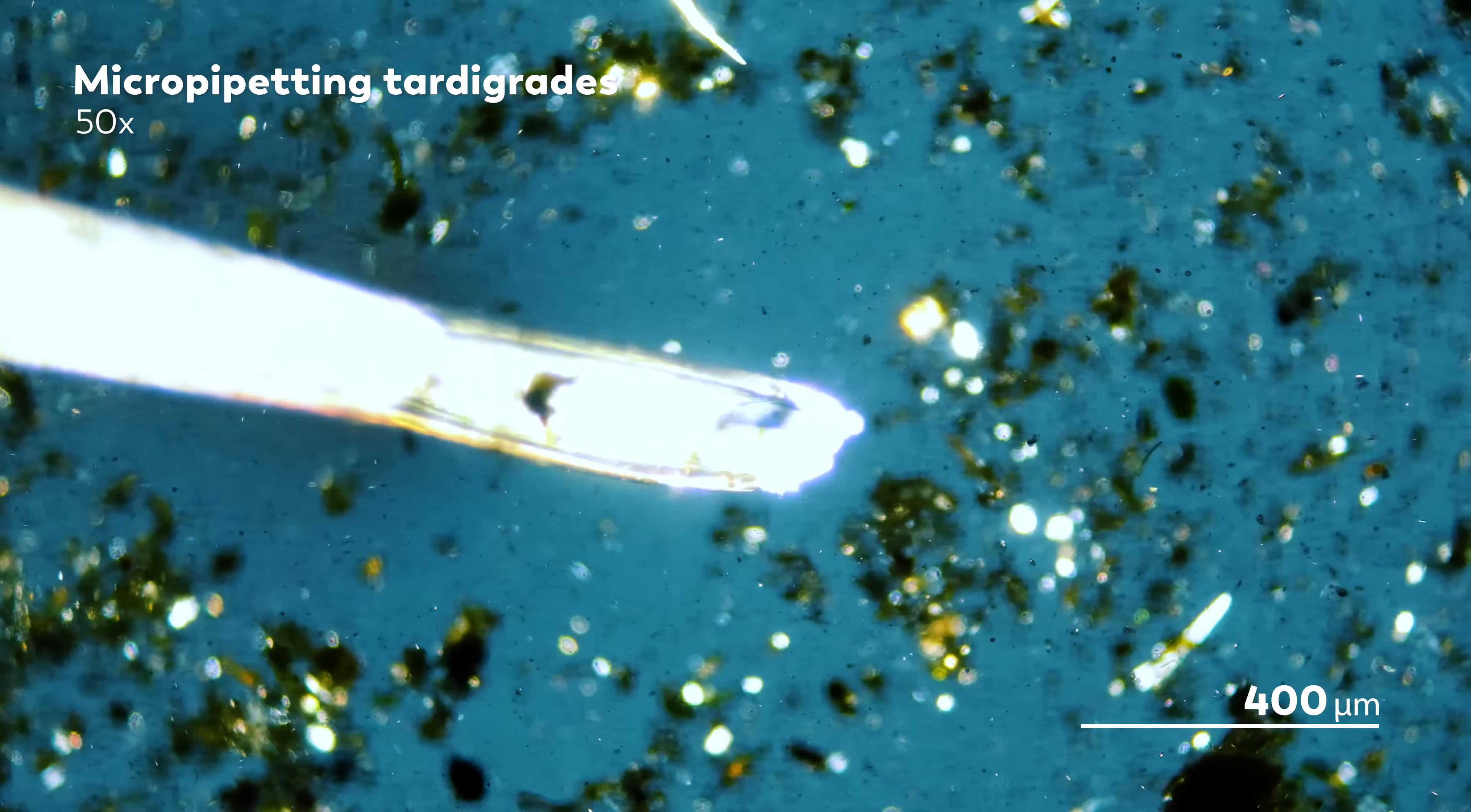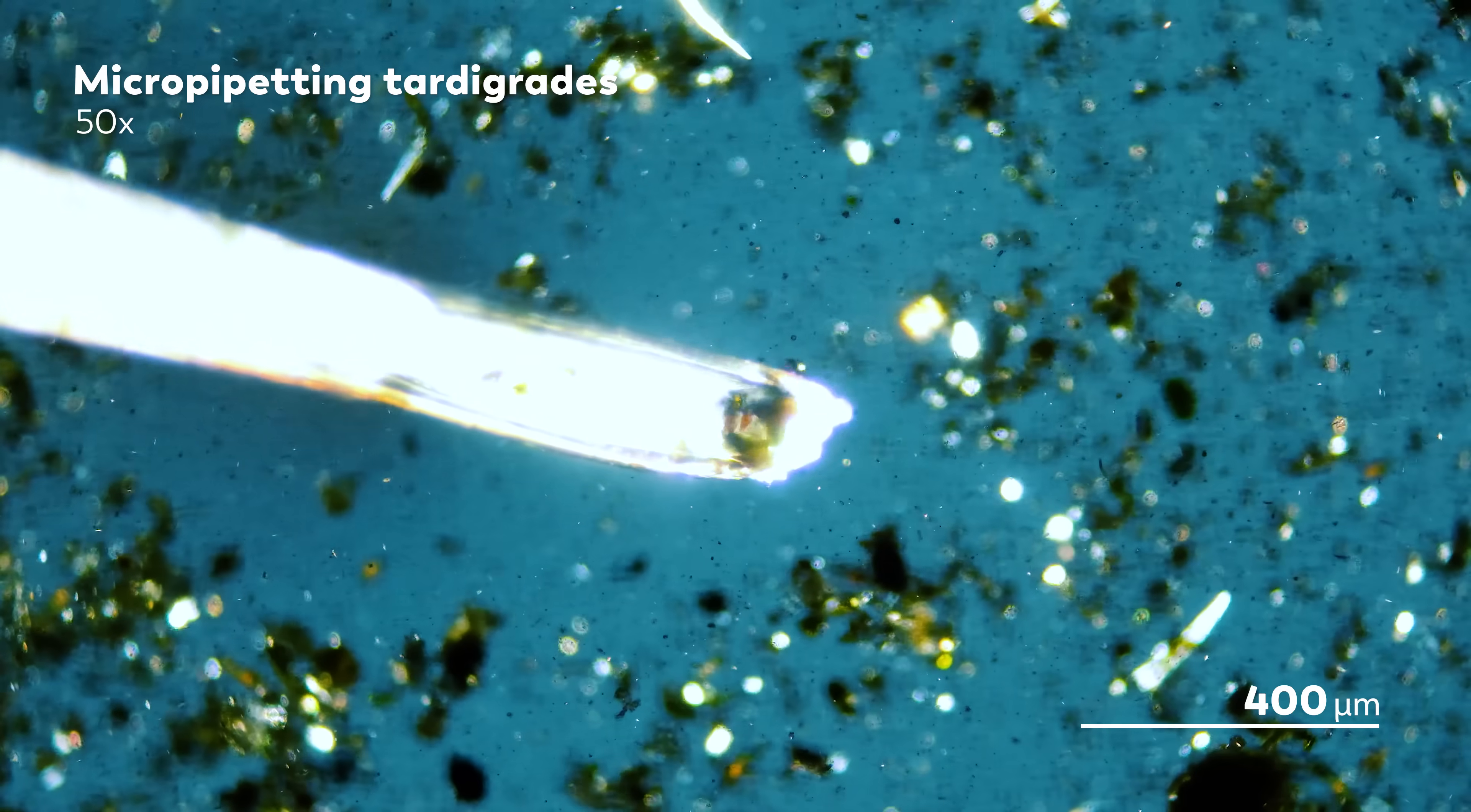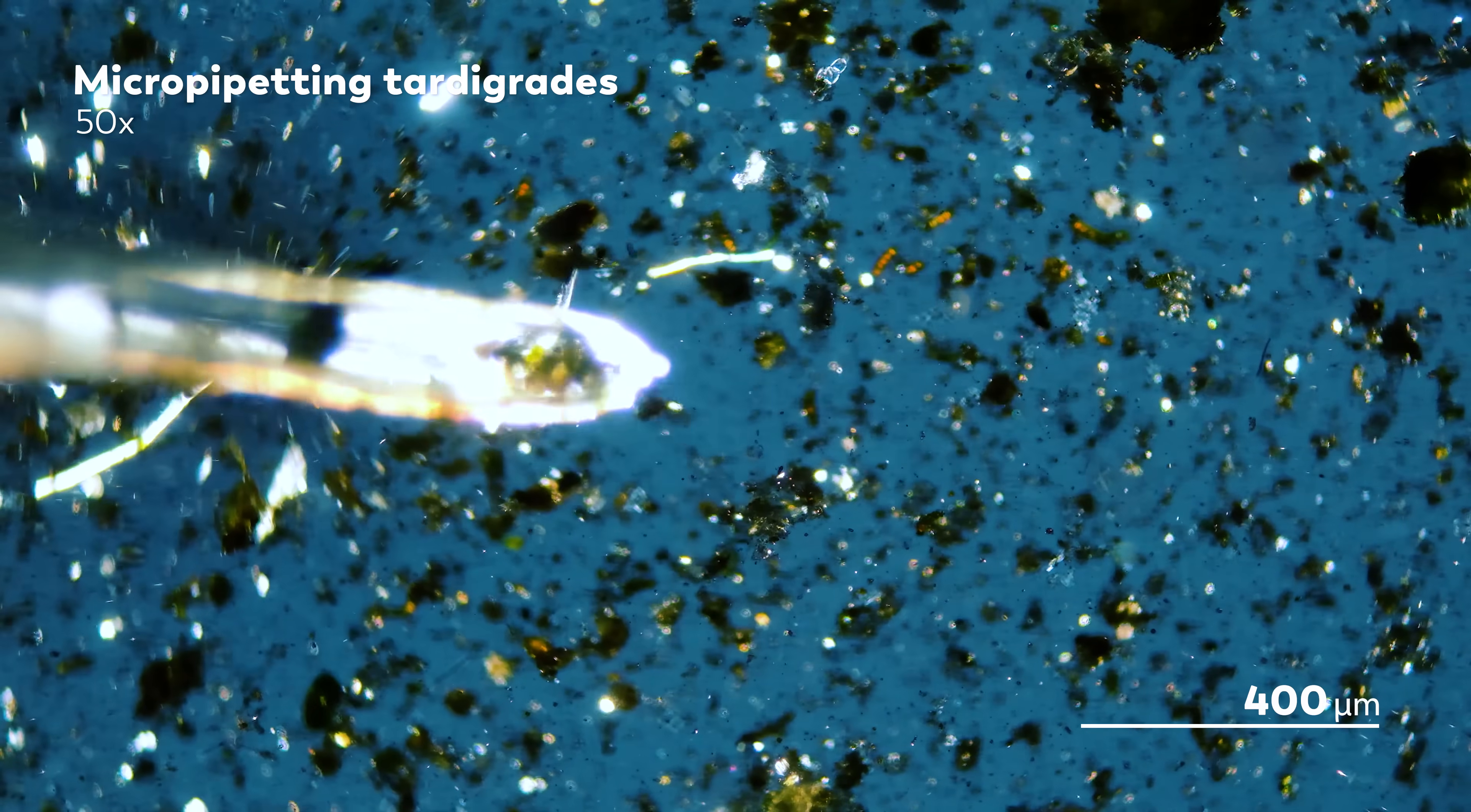To do micropipetting, you need a very thin tube. And traditionally, scientists use glass pipette tubes as the starting material for their micropipette. They heat the pipette over a Bunsen burner and slowly stretch the tip out so that it forms a thin, hollow tube. But for James, this became a problem, because it required a lot of glass tubes, and that became quite expensive.